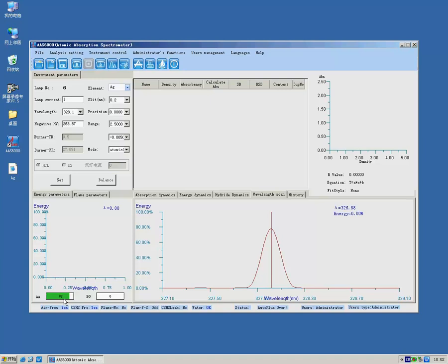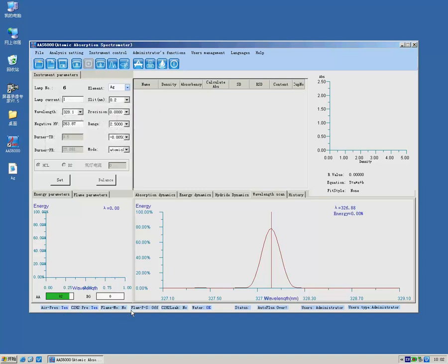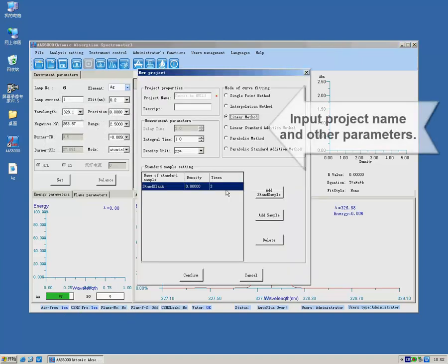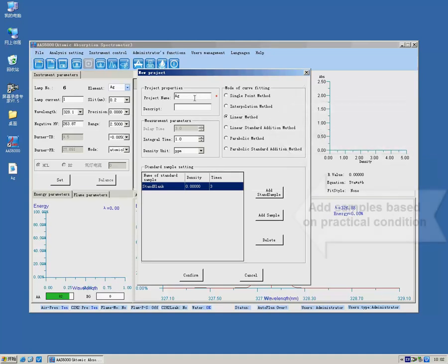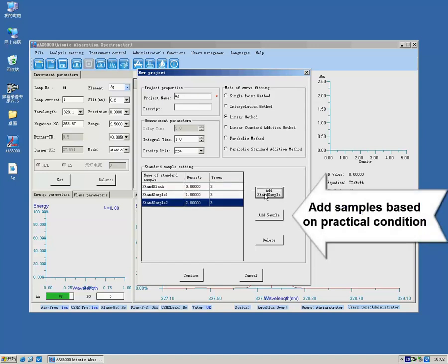Create a new project. Enter relative information. Add standard samples and unknown samples, and revise concentrations according to actual situations.